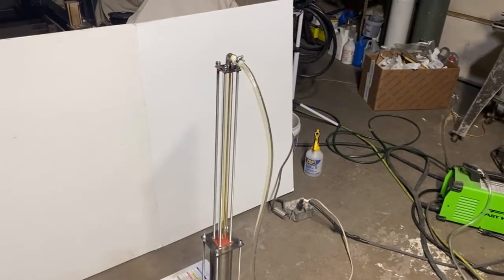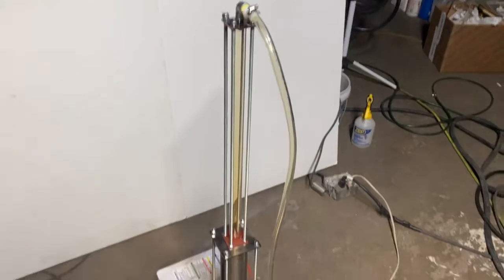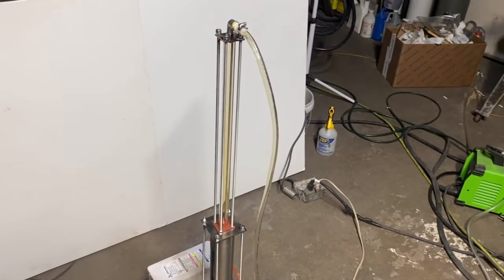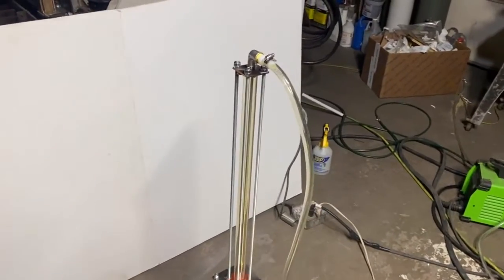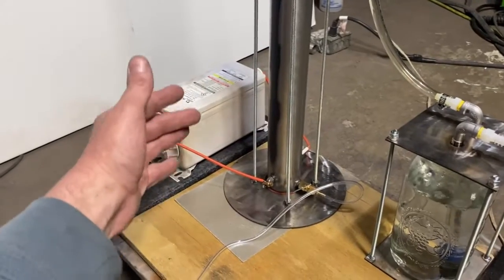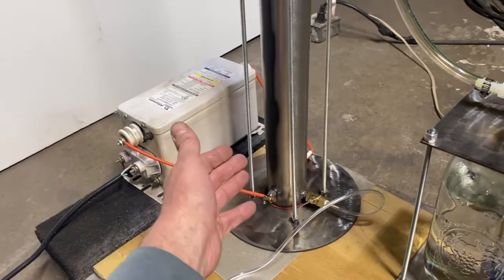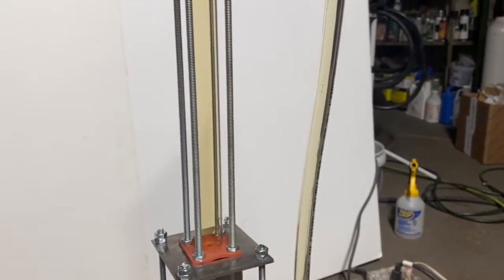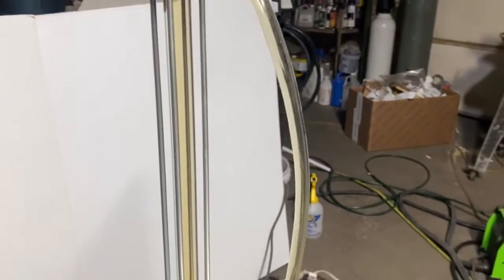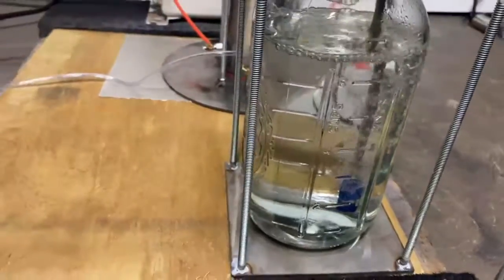We're about six hours and 37 minutes in. We've got some good nitrogen dioxide color. We start off with NO gas — nitric oxide — which reacts with oxygen in the flow and then turns into this brown gas, nitrogen dioxide. That brown gas then dissolves in this water, producing nitric acid and nitrous acid.